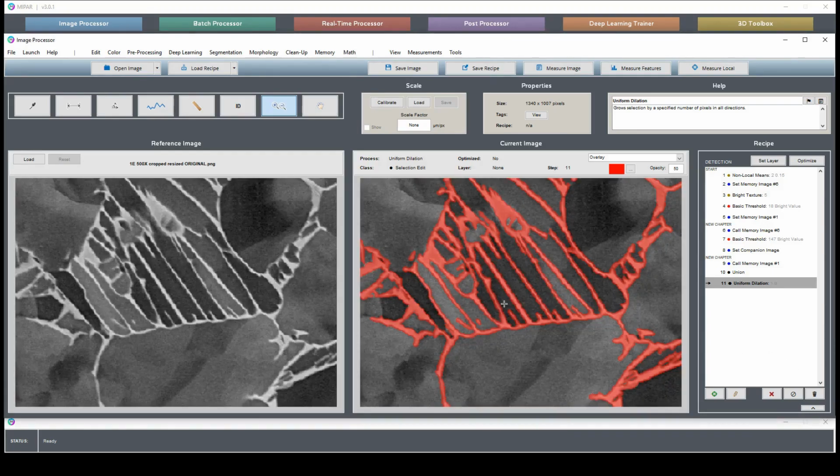Well, if you want to remove pieces of dark selection that are adjacent to bright selection, I use generally an adaptive threshold for that. Specifically, we're going to use it as a mask. So we'll feed this segmentation into the adaptive threshold, and then look within it for pixels that are brighter than other pixels also within the mask.